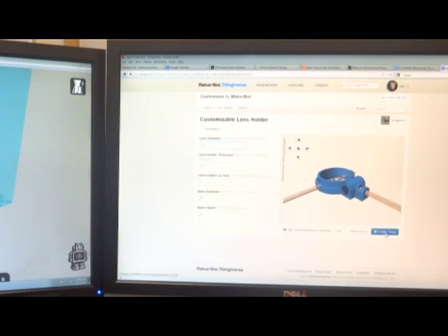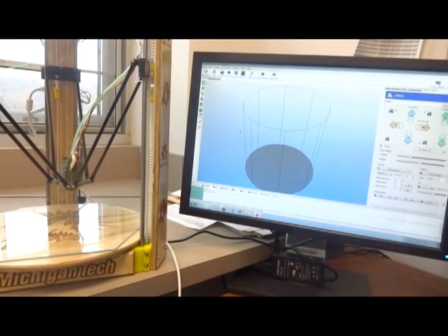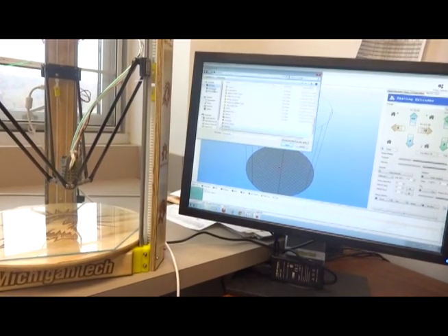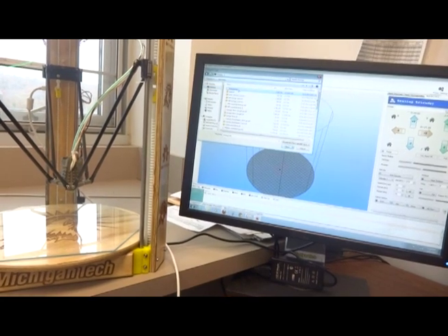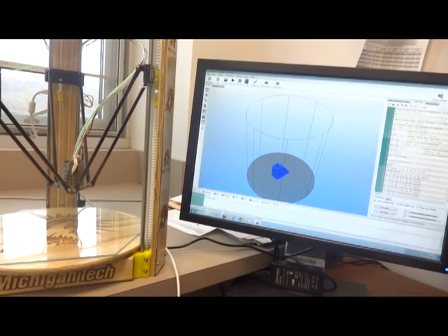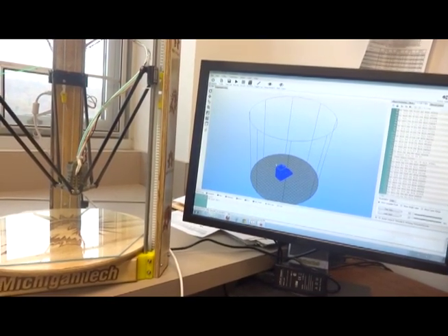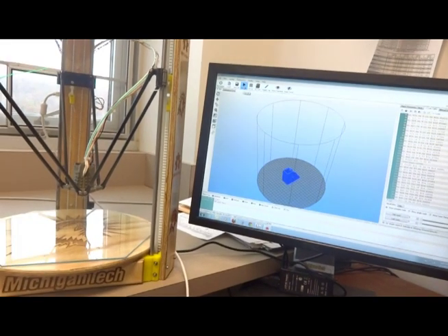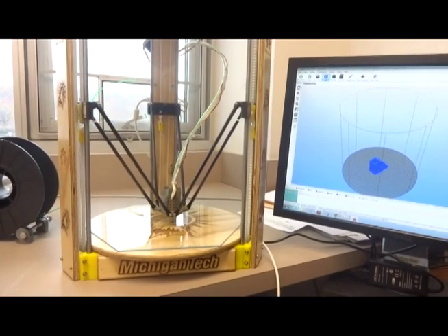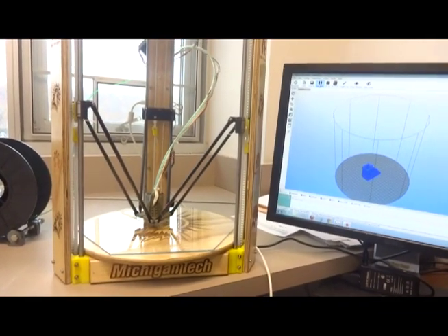When you're done, you simply click on 'create the thing' and that generates an STL file. The STL is then opened in a slicing application where you take the exterior of the object, denoted by the STL file type, and convert it into G-code. G-code is simply the instructions that tell the printer how the head is supposed to move. Here I'm opening up the G-code for a specific microscope component, and we're going to print it the same way as any normal two-dimensional file. The printer homes and then immediately begins to print your object, one layer at a time, building it up into a three-dimensional object.